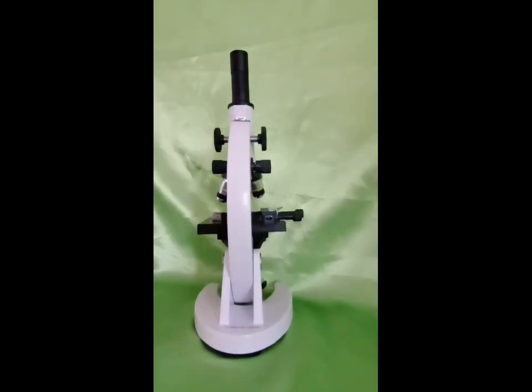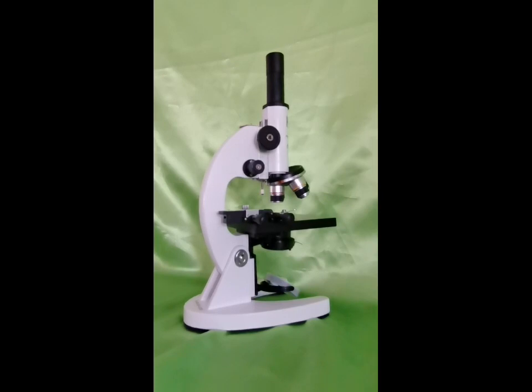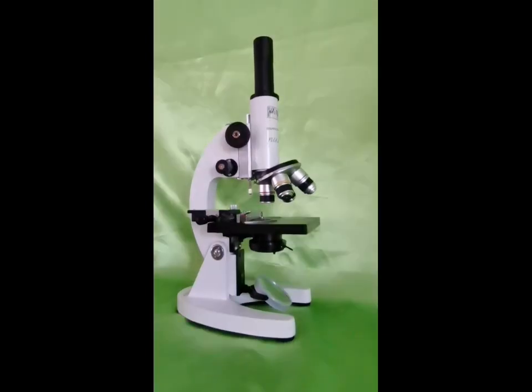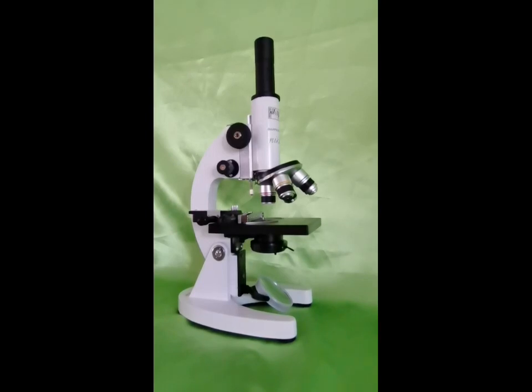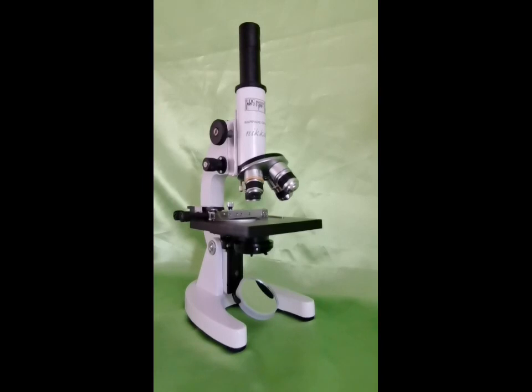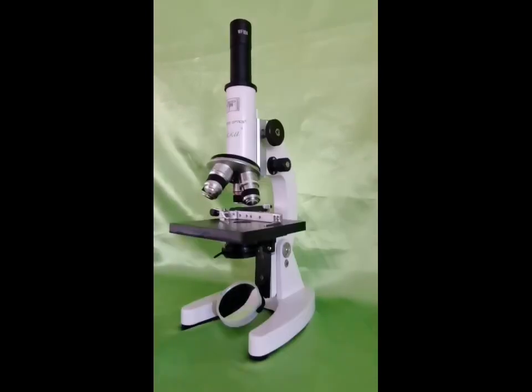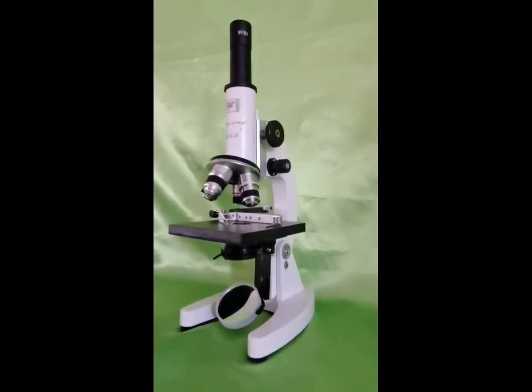Lastly, the mechanical parts. These parts give support to the microscope and the object being examined. We have the base, arm, inclination joint, stage, body tube, draw tube, revolving nosepiece, coarse adjustment knob, fine adjustment knob, and the stage clip. Now, let's take a look at the specific parts and their functions of the microscope. Are you ready? So, let's start with it.